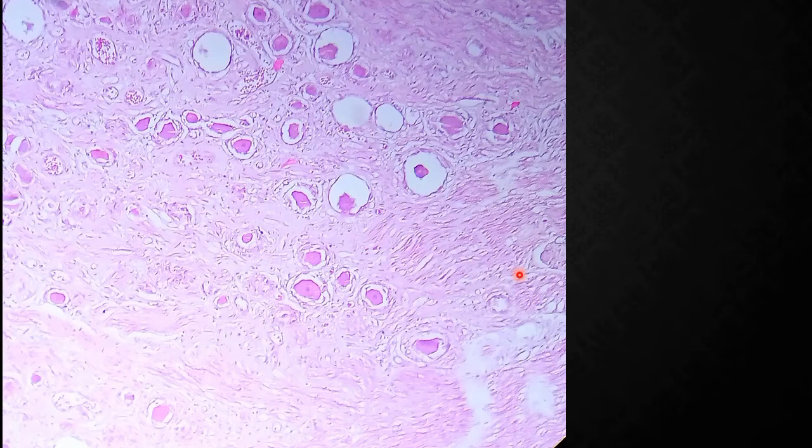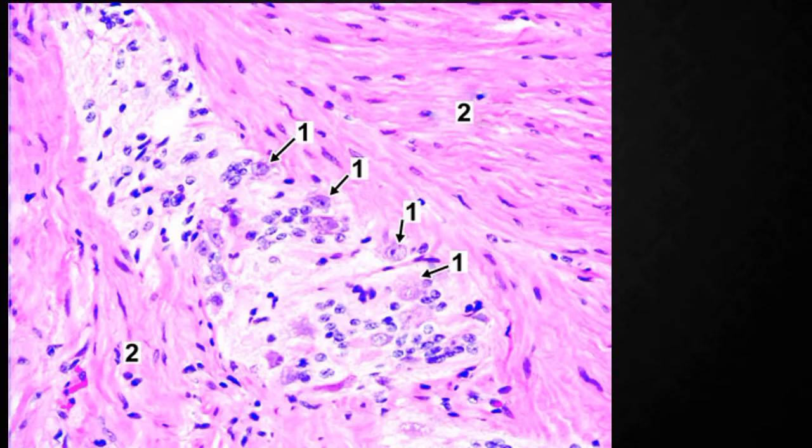So the identification points to write are the presence of pseudo-unipolar neurons encircled by satellite cells, and the number of satellite cells is more. Then let us move to the sympathetic ganglia. Coming to the sympathetic ganglia, multipolar neurons are present. The satellite cell number is also less when you compare with the pseudo-unipolar neurons present in the sensory ganglia. Let me show you the slide image.